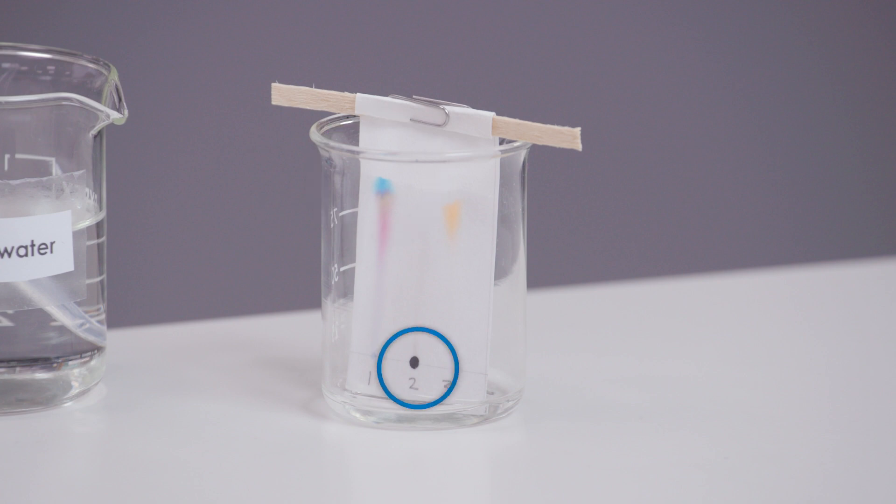Sample two didn't separate and is still on the origin line. This is because sample two is insoluble in water so we don't know if it's pure or impure.